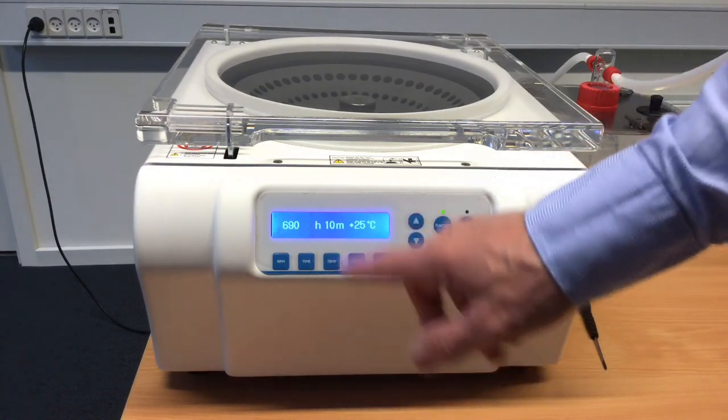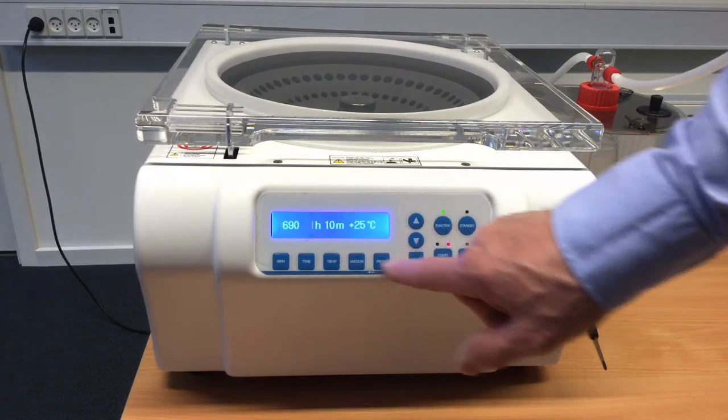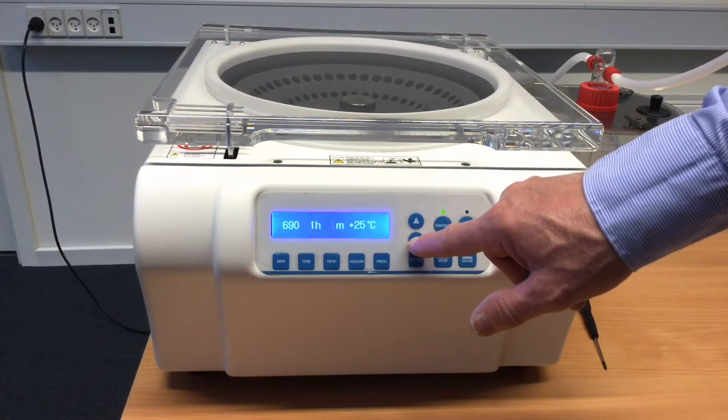Then you can select time. If we want to change the time to run for an hour, say yes, and then decrease to 0 minutes as needed. Press enter.